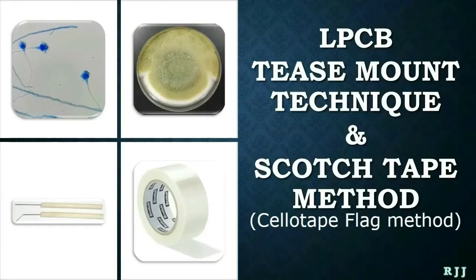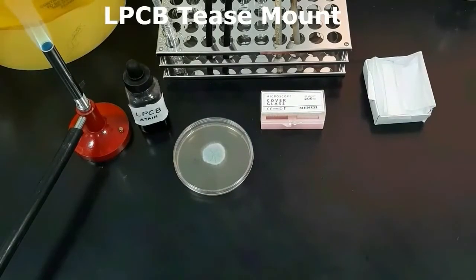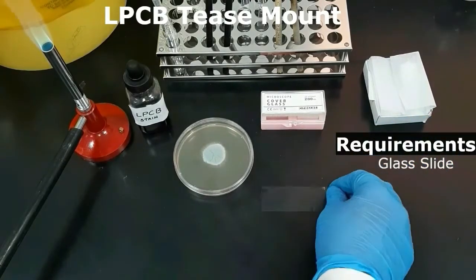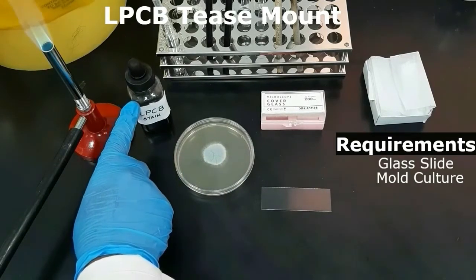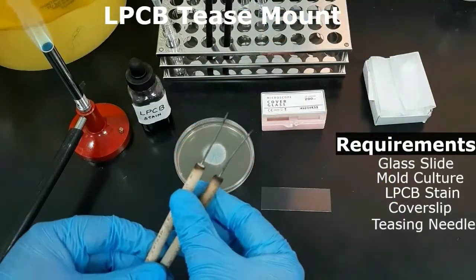In this video I will demonstrate the procedure of lacto phenol cotton blue tease preparation and scotch tape preparation in mycology to examine the fungal structures. First, let's see the requirements needed for the tease method: a good grease-free glass slide, fungal culture plate, lacto phenol cotton blue stain, cover slip, and sterile teasing needles.